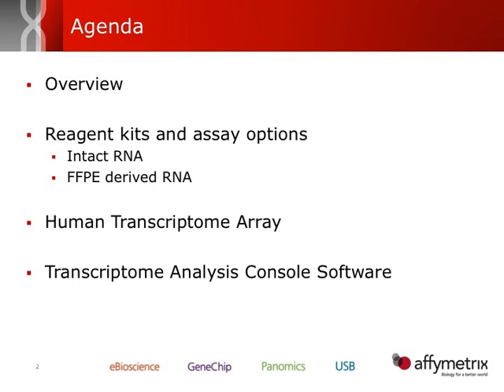Then we'll talk specifically about the array itself, talk about some of the details of the array. And finally, we'll conclude with the analysis portion. Affymetrix has designed software to do the analysis for this particular array. And so we'll conclude with a brief discussion about the software itself.